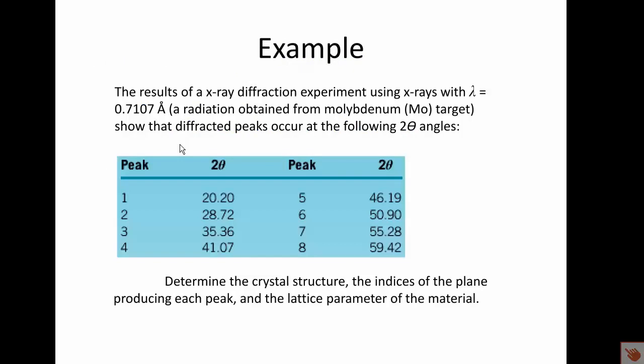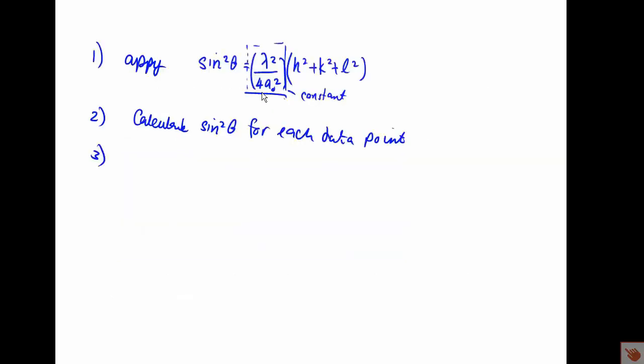So once we've done that, we realize that they're going to form a series. And this part increases according to an integer level.